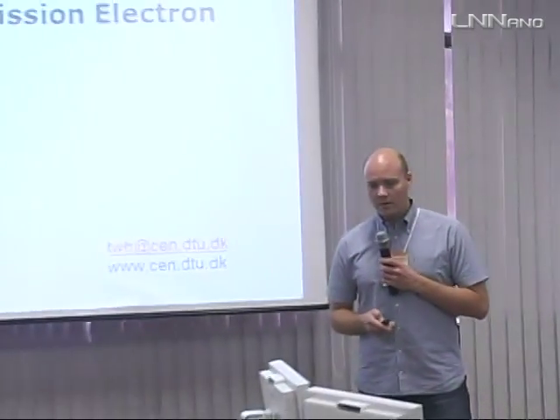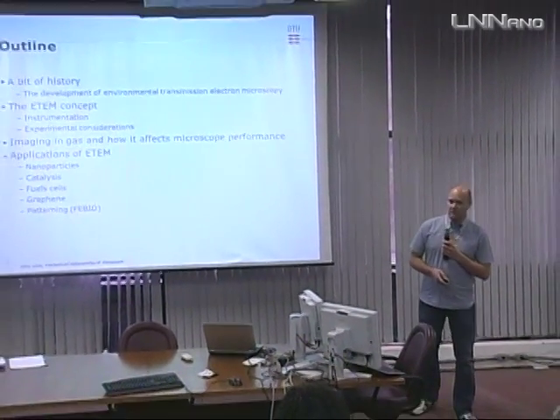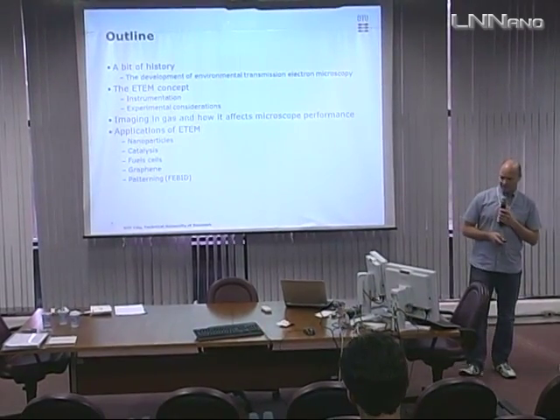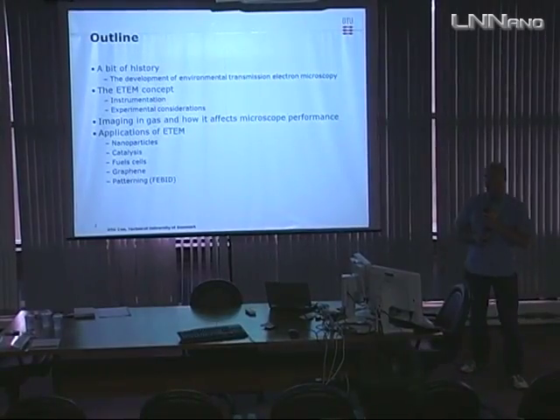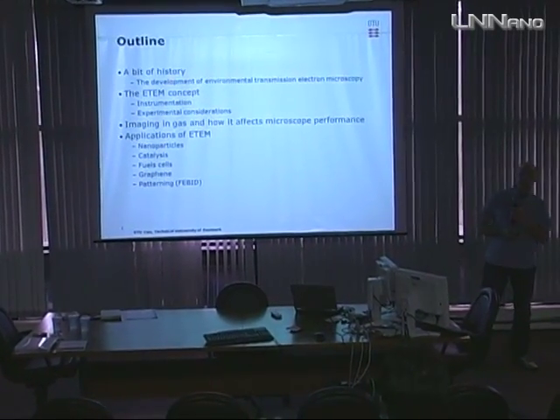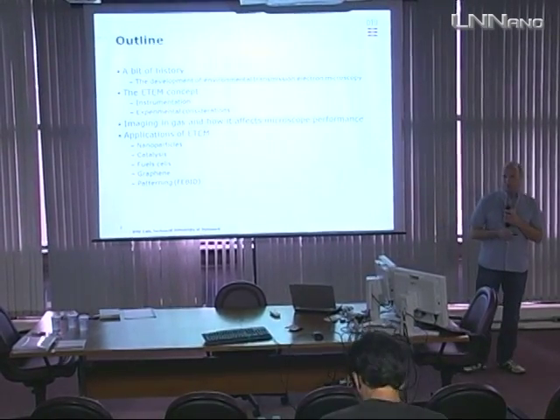going to be about in situ TEM, especially one specific variant of in situ TEM called Environmental Transmission Electron Microscopy. And just to give you a brief outline of what I'll be talking about today, first I'll start out with a bit of history. I won't dwell on that too much because history is always a bit boring. Then I move on to the concept, show you a bit of how the instrumentation works, and then I'll move on to a bit of experimental considerations that you need to do before you do your environmental TEM experiments.